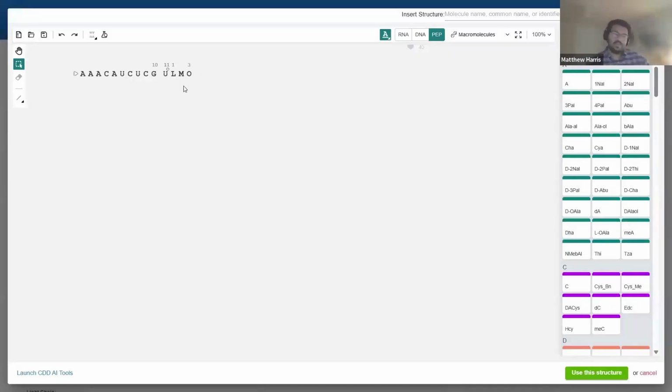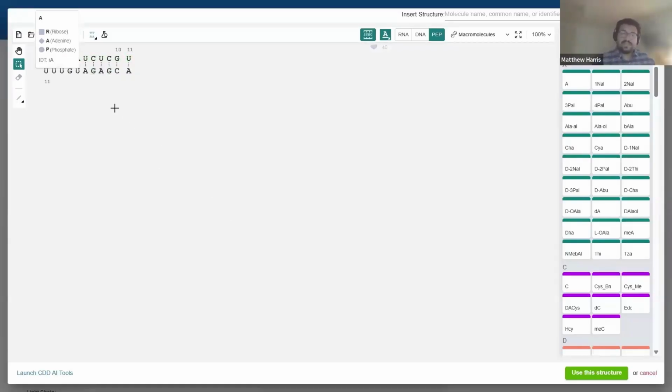Now, if we just remove these amino acid bases that we have here in our sequence, we can also show that if I select the highlight button again and highlight just a portion of my sequence here, I can now create an antisense strand with just what I've selected as the short sequence. I could have also done that, if I do the back button, if I had selected the entire sequence and created an antisense strand from that as well. So it's very easy to start adding these into your growing sequence if you want to add that here.